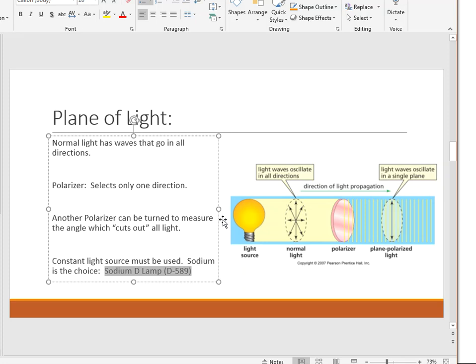Those solvents are chosen because they probably are not chiral, which means they're not going to rotate light in the first place, but we just want to be safe. We want to make sure that it is 0, and that if there is any slight contamination in the solvent that would have a chiral molecule, that would rotate the light left-handed or right-handed on us, that we eliminate that out. We do not want the solvent to play a part in our reading.